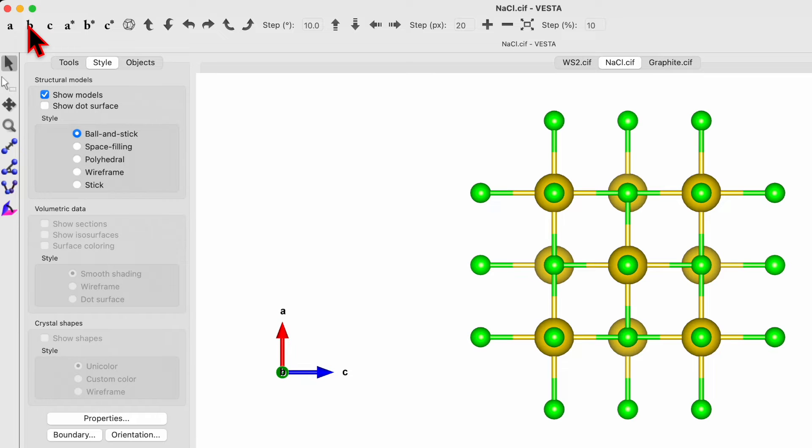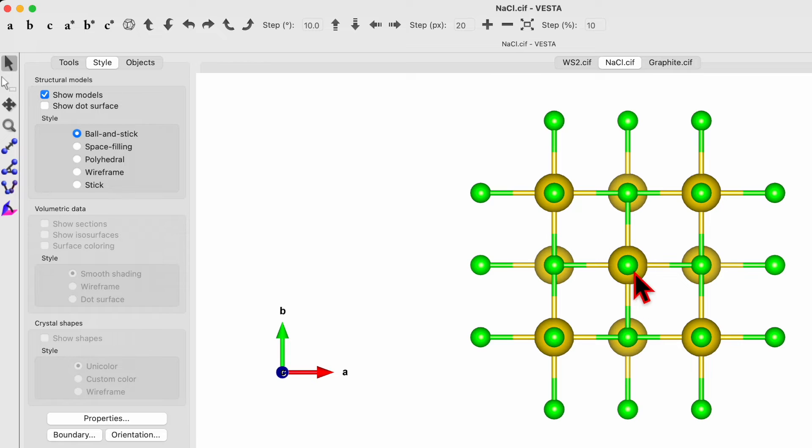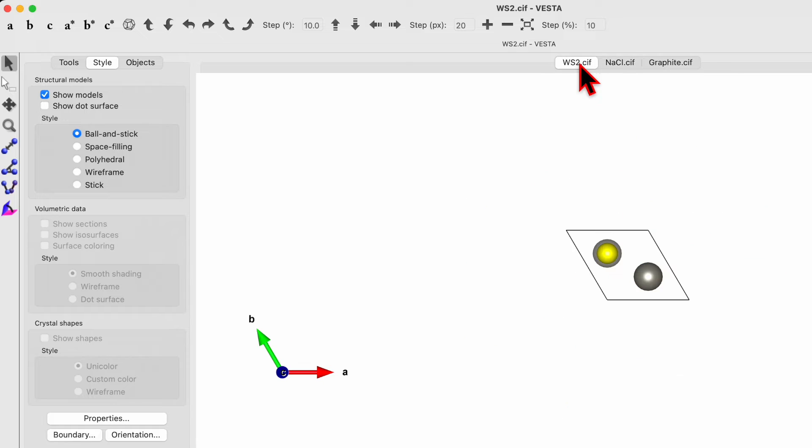View along the B axis, view along the C axis. You may be confused why it looks same from all three different directions, because it's a cubic structure.